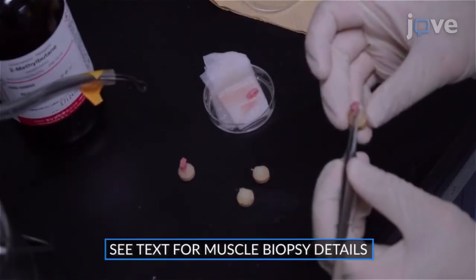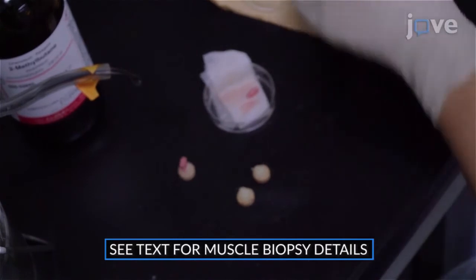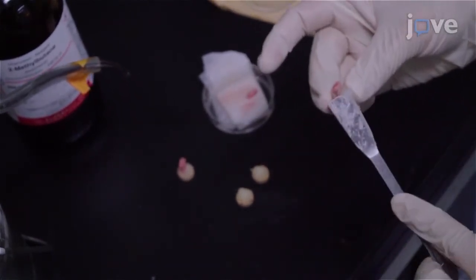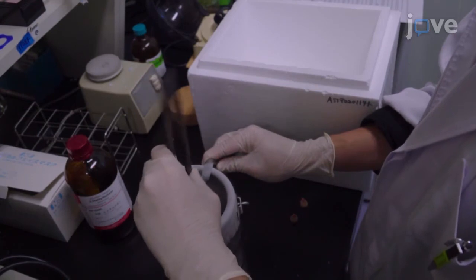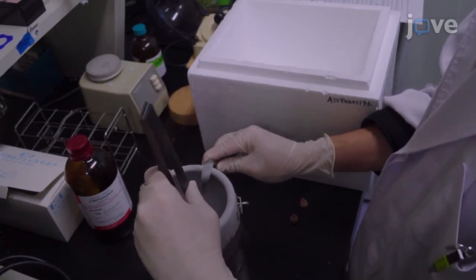Place each specimen into the tragacanth gum on the discs with the longitudinal axis of each muscle perpendicular to the cork. Place gum around the bottom of each muscle to help hold the muscle in place, and use tweezers to freeze the specimens in the cold isopentane. Move the specimens continuously for one minute or until completely frozen before placing them temporarily.